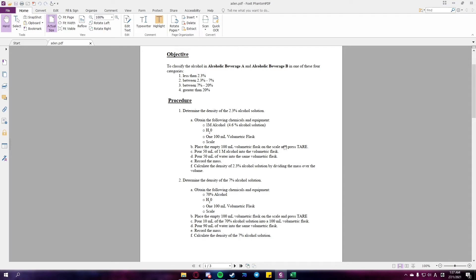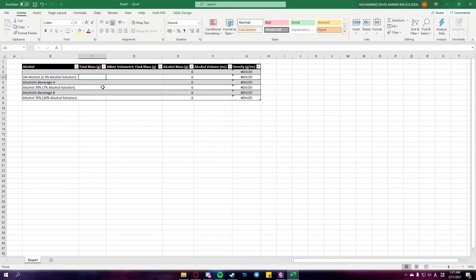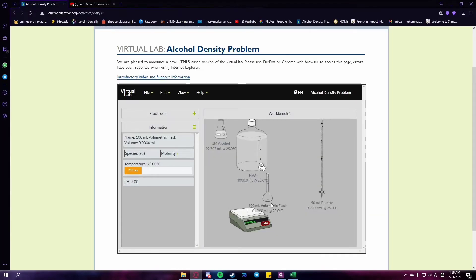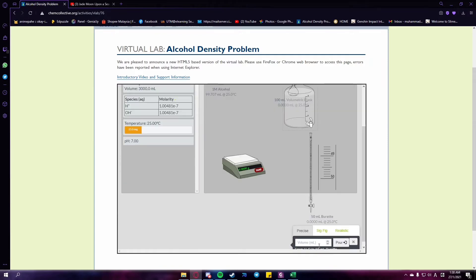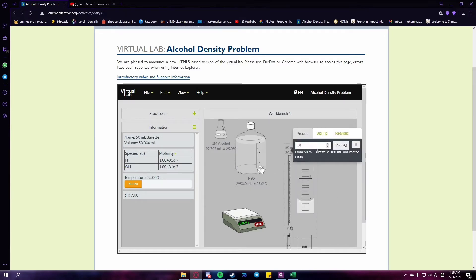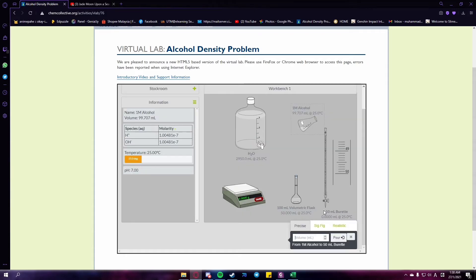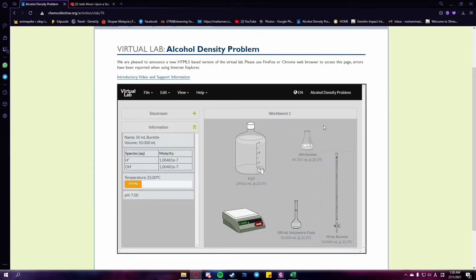Let's move on to the first procedure, which is to determine the density of the 2.3% alcohol solution. In procedure 1, we need 1 molar of alcohol which is a 4.6% alcohol solution, water, a 100 ml volumetric flask, and a scale. The first step is to place the empty 100 ml volumetric flask on the scale and press tare, then record the mass.